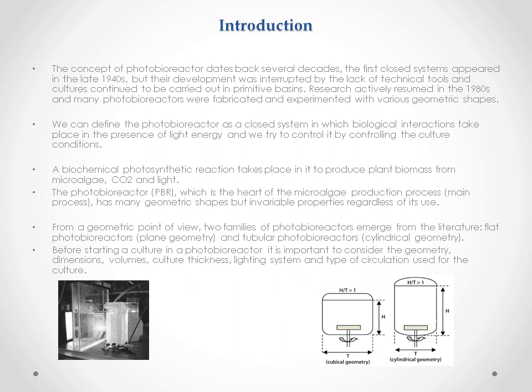The photobioreactor can be thought of as a closed system where biological interactions occur in the presence of light and energy, and which we attempt to control by adjusting the culture conditions. The photobioreactor, which is the heart of microalgae production, has a variety of geometrical forms, but constant properties regardless of its use. From a geometrical perspective, two families of photobioreactor can be listed. We have flat photobioreactors and we have tubular photobioreactors.